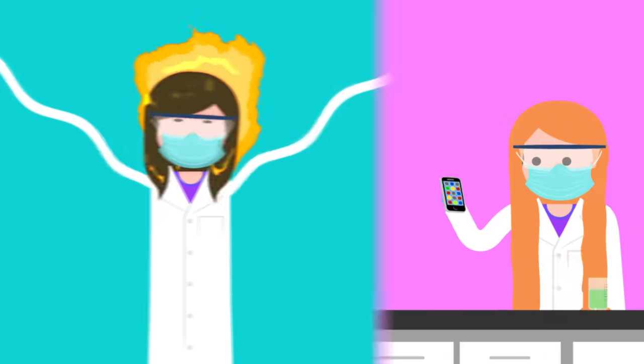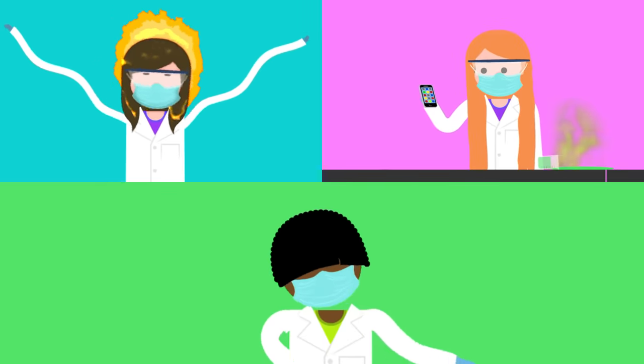Let's start with some very basic safety stuff, your hair. If your hair is long, it shall always be up in the lab. If it is not, it will catch on fire. I've seen it happen. It could also knock stuff over and occlude your vision and droop into your flask. Same thing goes for anything that might hang off your body in the lab. Droopy clothing, especially sleeves, are a total disaster.